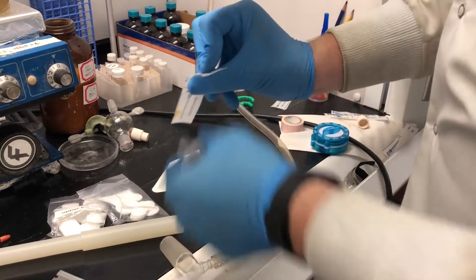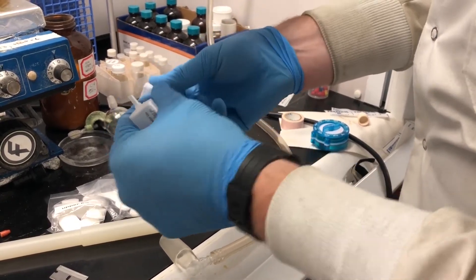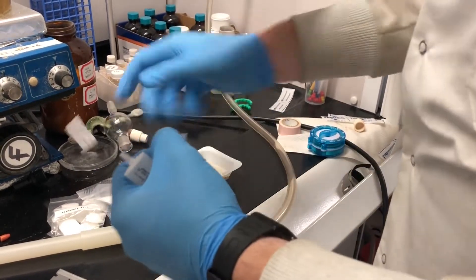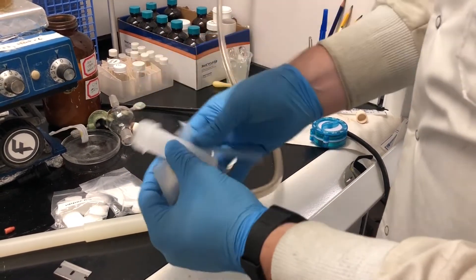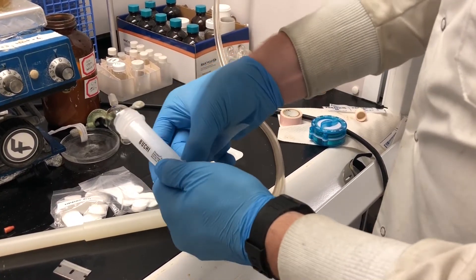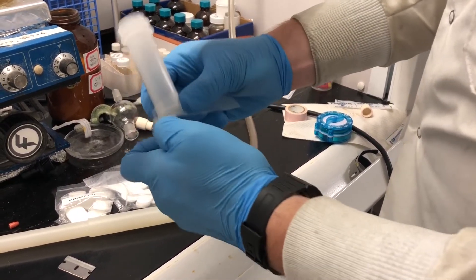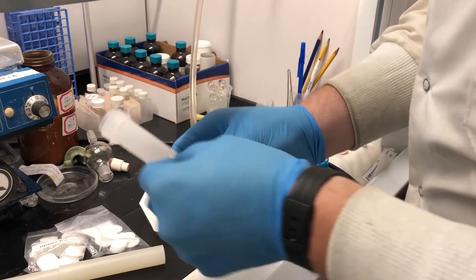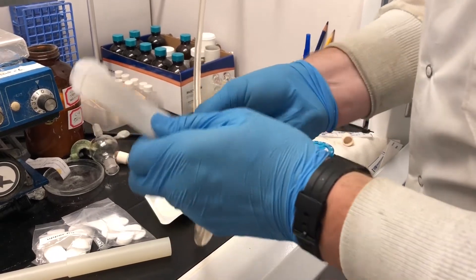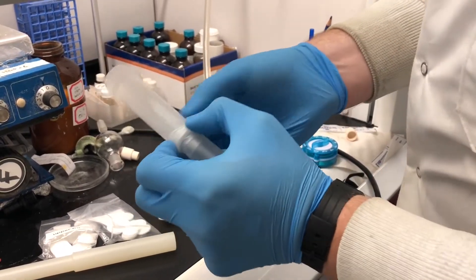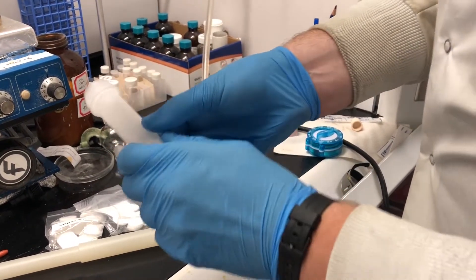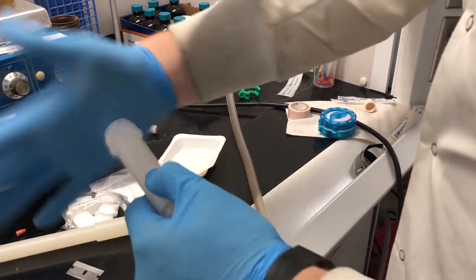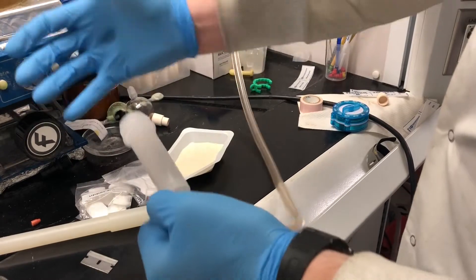You're going to take the parafilm and seal it. It doesn't need to be a tight seal initially. What's going to happen is your vacuum, once turned on, closes that seal. Now we have a tight seal there.